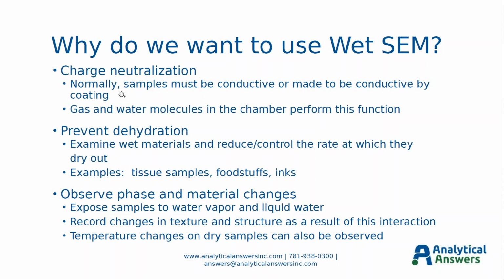But when you have a SEM that can introduce gas and water vapor, then the gas and water molecules can perform neutralization for you. And that can be advantageous when you have highly structured samples where getting a uniform coating would be difficult. And so the uniformity of the gas and water molecules around the sample actually provide better neutralization.